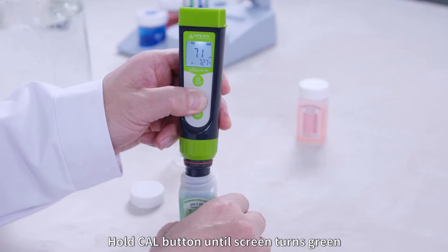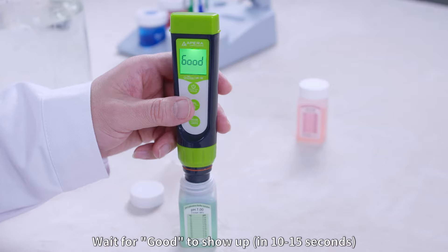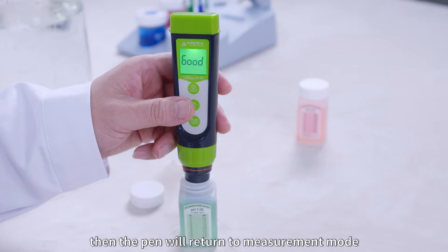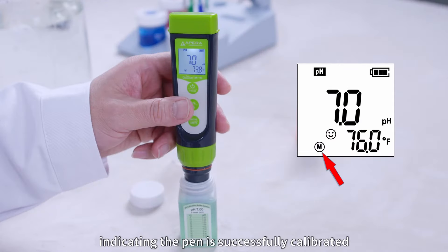Shake the probe vertically in the solution for a few seconds and let it stand. Hold the Cal button until the screen turns green. The pen starts automatic calibration. Wait for 'Good' to show up in 10 to 15 seconds, indicating the calibration is complete. Then the pen will return to measurement mode. Icon M will show up on the lower left corner of the screen, indicating the pen is successfully calibrated.